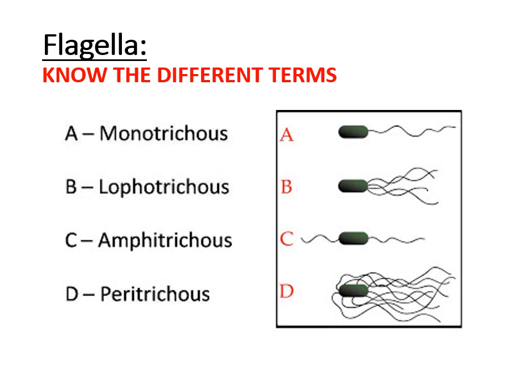Around the entire perimeter of the cell. Now, no matter which type of flagella structure or organization the bacteria has, it will basically whip those little flagella around and propel or move in the direction that the flagella force provides.